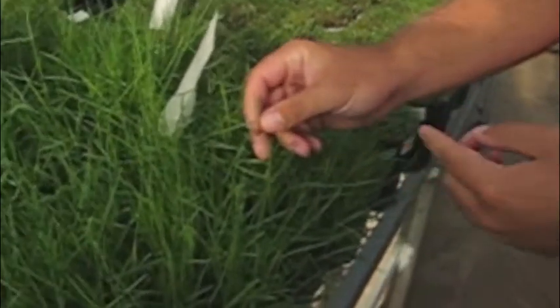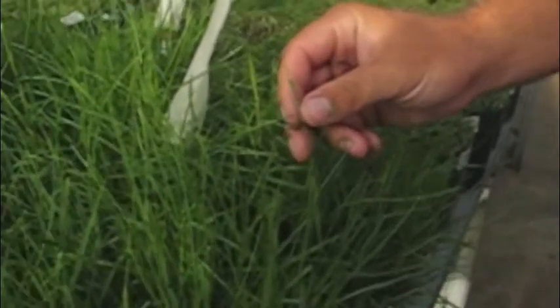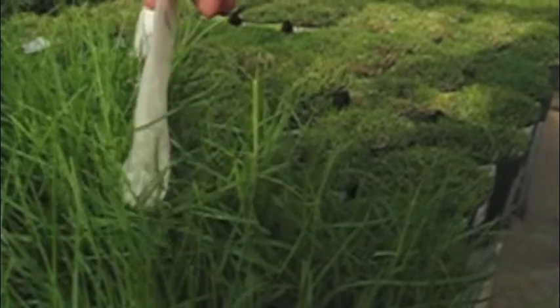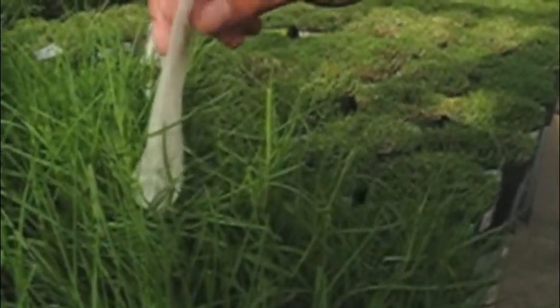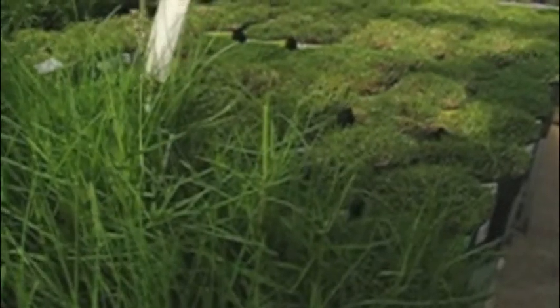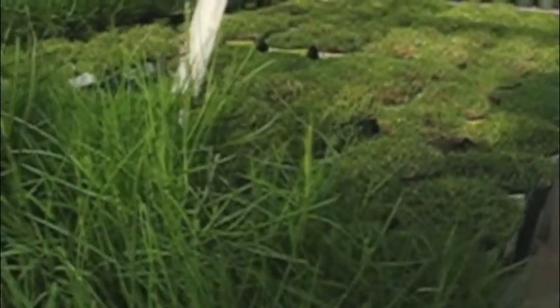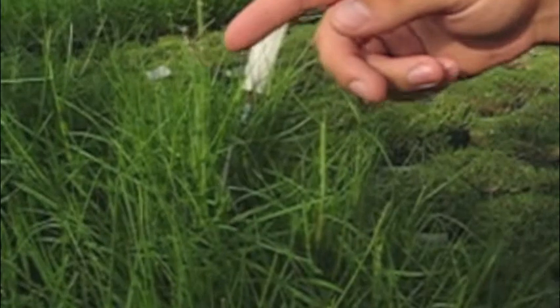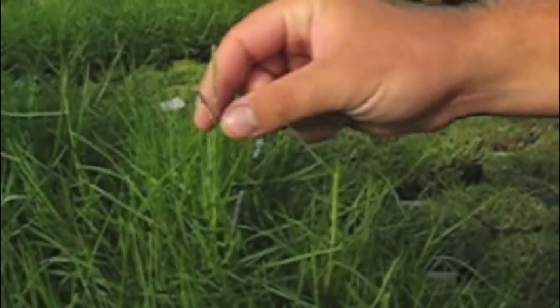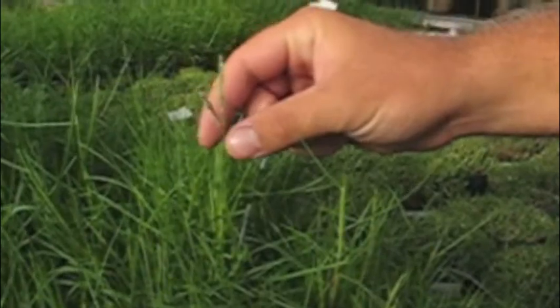As you can see here, the stigmas and the anthers haven't emerged yet, so you go ahead and cover it up with one of these glassine bags. Once your stigmas have emerged — like this plant right here — you can see there's all these white little anthers and the purple stigmas, so this would be a parent that you'd be able to use for crossing.